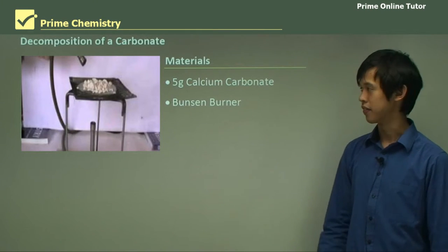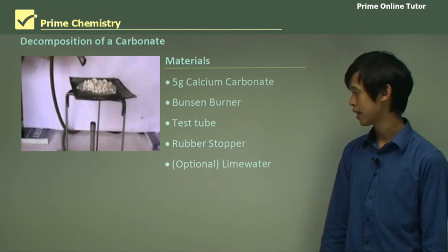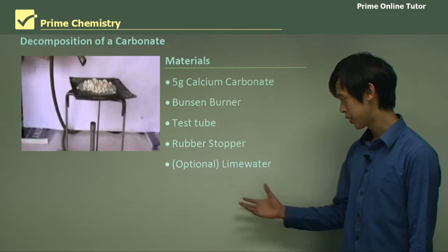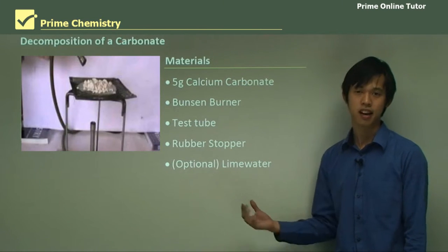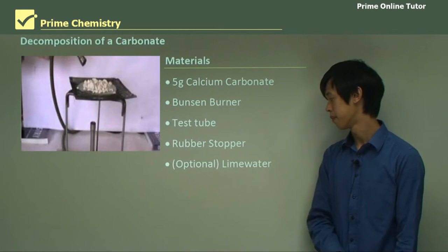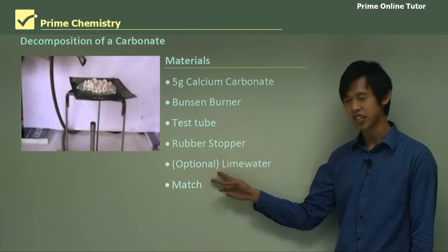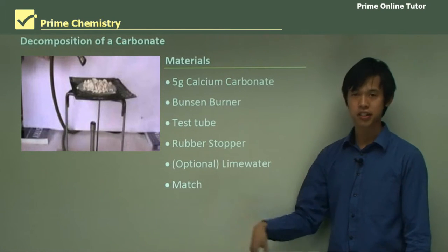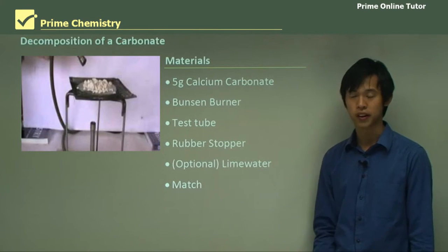Bunsen burner, obviously for the heat part of it. Test tube, rubber stopper, and optionally we could use lime water. We don't need this, but it's nice to have for the results part. We also need a match. You can interchange these two. If you have matches on hand, that's good. If you have lime water on hand, that's good also, so either one will be fine.